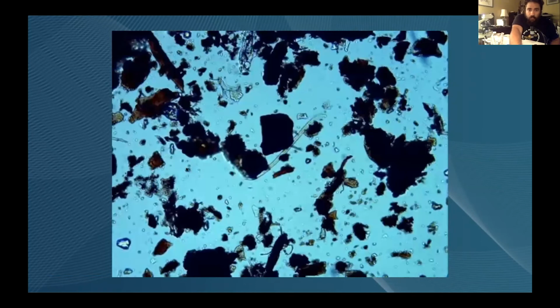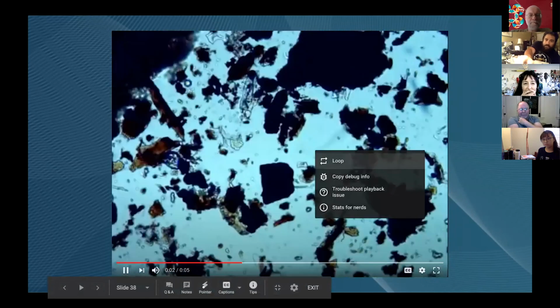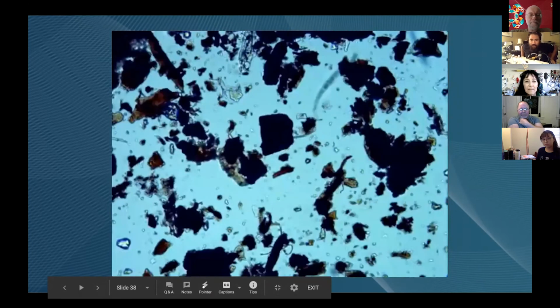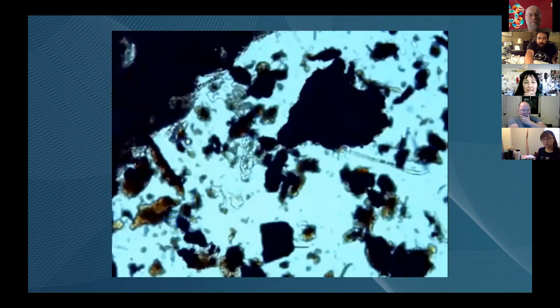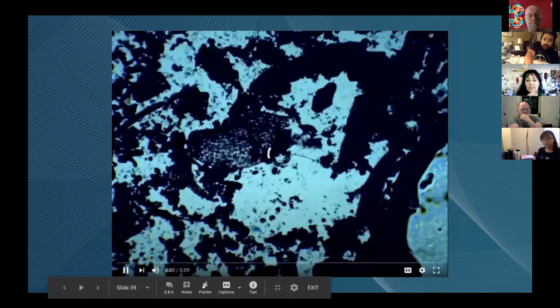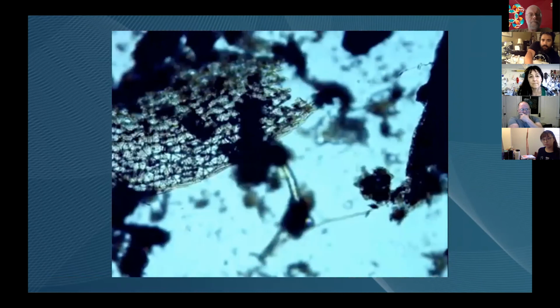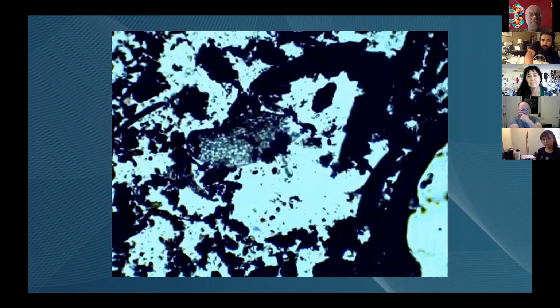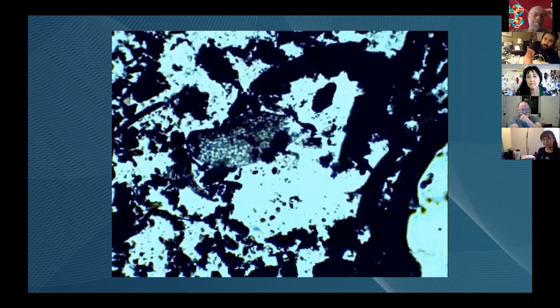And then here we see a bit more. We'll see some nematodes, and we'll actually see some strands of fungi along with bacteria. You see a little nematode moving around. He's a little stressed out because he's pressed between the slide and the cover slip and whatever organic material and parent material that's kind of moving there in general. And this one's probably my favorite because we can actually see fungi, a nematode, some plant matter, and some bacteria. So we see the fungus moving around that little strand of mycelium. We see the actual net of the plant root.